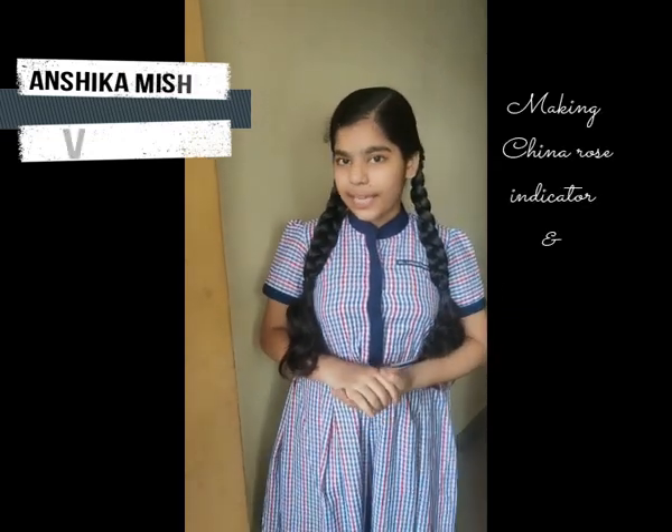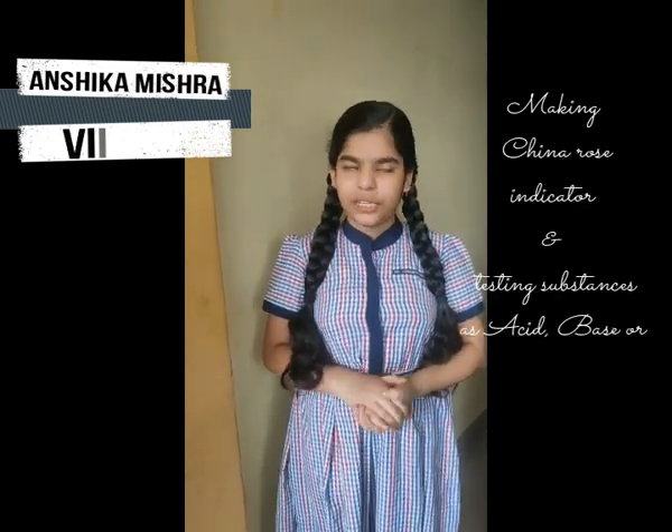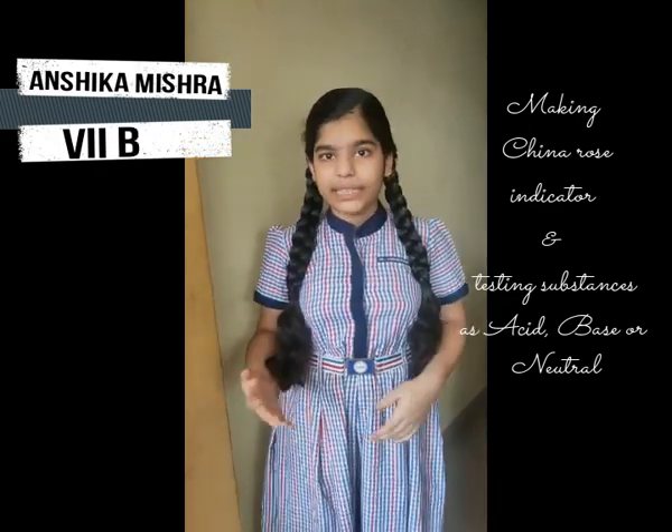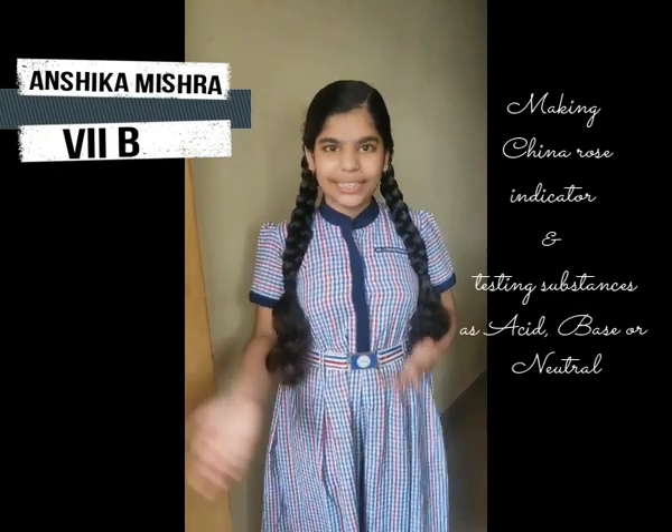Hello everyone, myself, I am Anshika Mishra and I am from class 7B. Today I am here to perform a science experiment for my science exhibition. That is, making China Rose Indicator and testing substances as acidic, basic and neutral. So, let's get started.